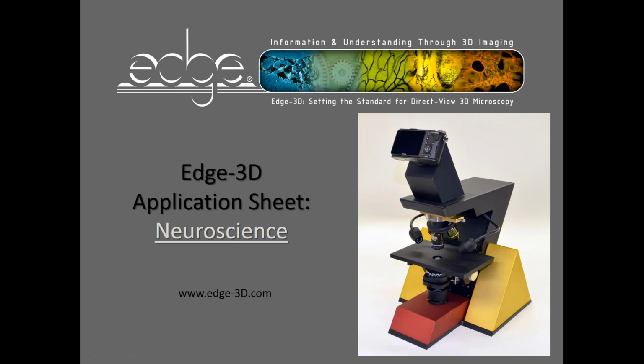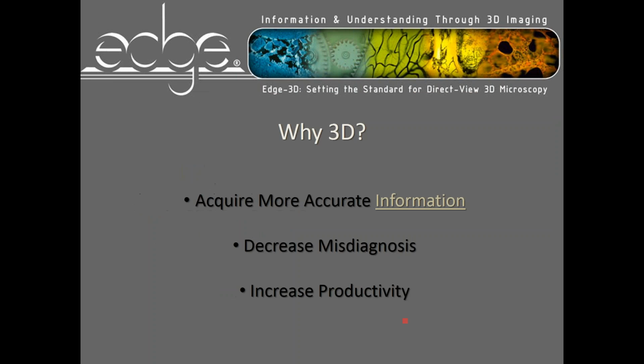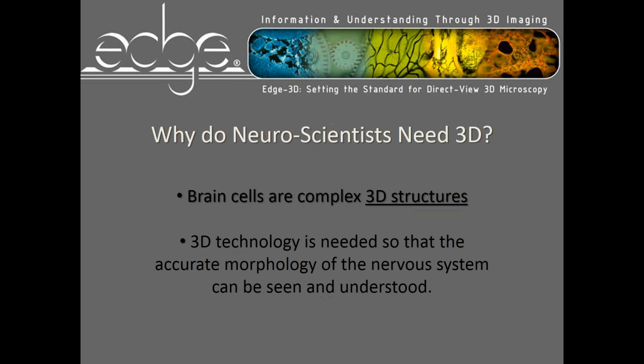This is an application video about the benefits of the Edge-3D microscope for neuroscience research. Why would one want a three-dimensional microscope? The real reason is to acquire more accurate information, and in the process, to decrease misdiagnosis and increase productivity.